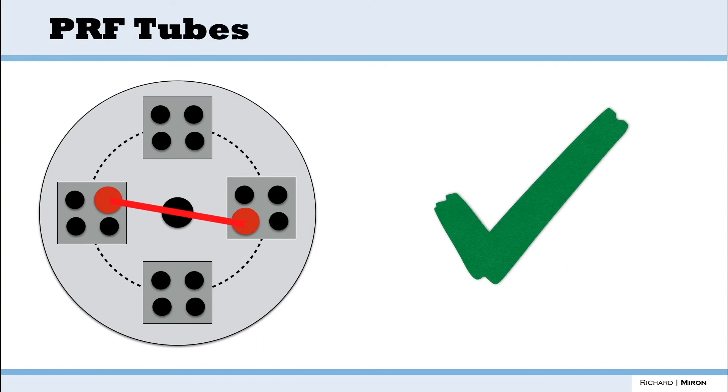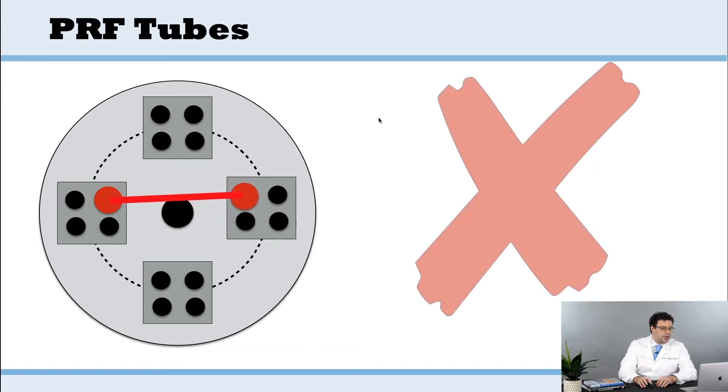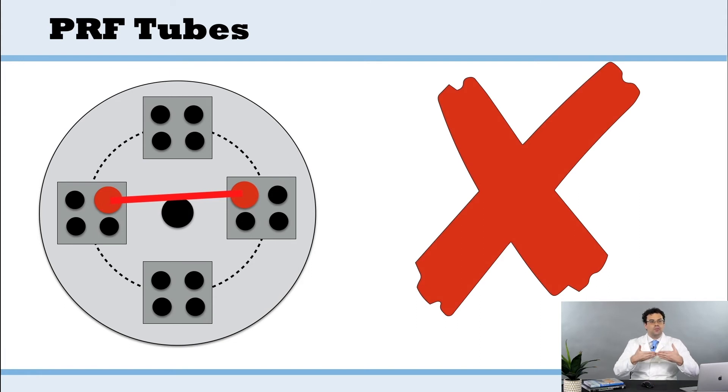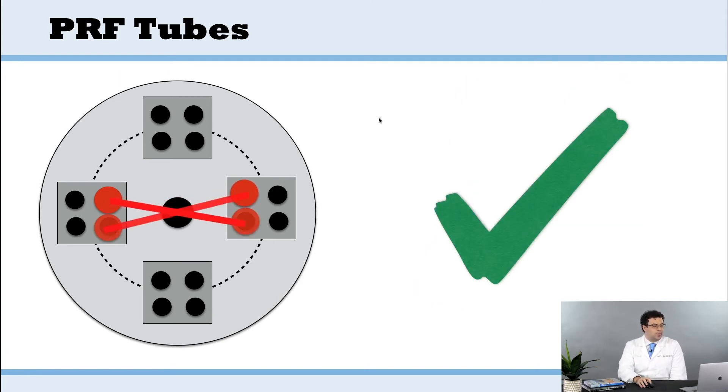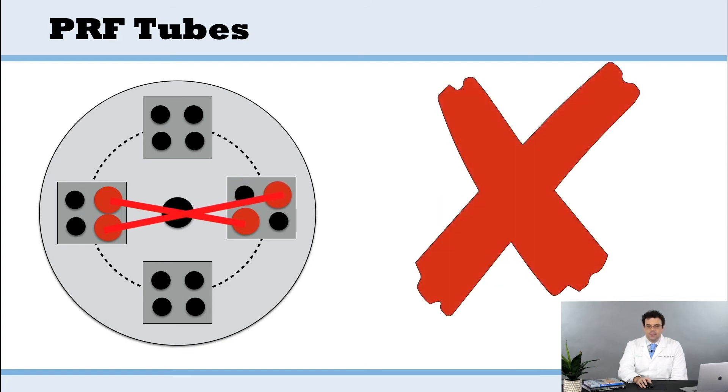For centrifuges that have buckets, you always want to crisscross again. With a centrifuge of this kind, you can't balance straight anymore — it always has to be crisscrossed. That's another mistake we see some people make. This is properly balanced; you can't position them like this. Very straightforward.